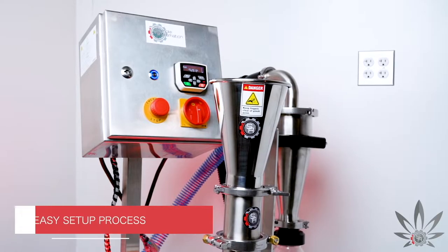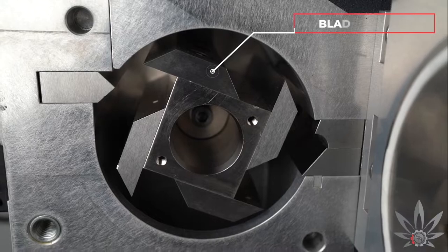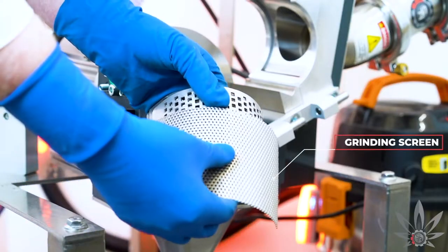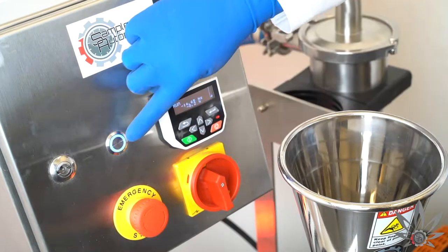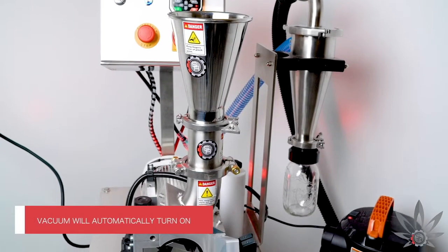Setup for the SAMS15 cutting mill is fast and easy. Once a technician chooses their desired blade location, grinding screen, and blade speed, they can turn on the machine. The vacuum will automatically turn on and you're ready to begin milling.